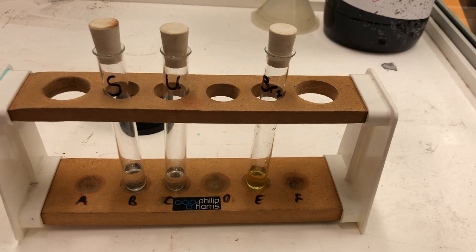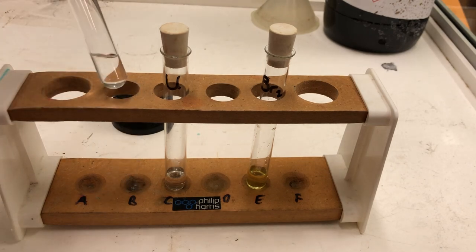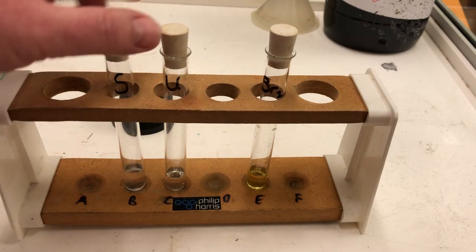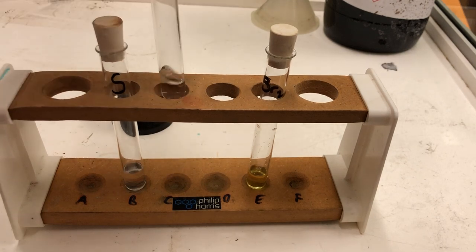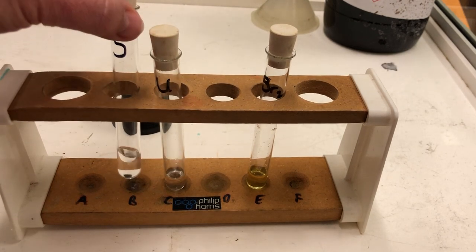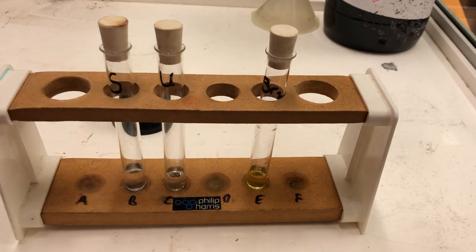I will turn on the fume cupboard. It will make a loud noise and I will not be speaking while we add the bromine water to the saturated hexane and the unsaturated hexene. Note hexane and hexene are both clear and colorless liquids.